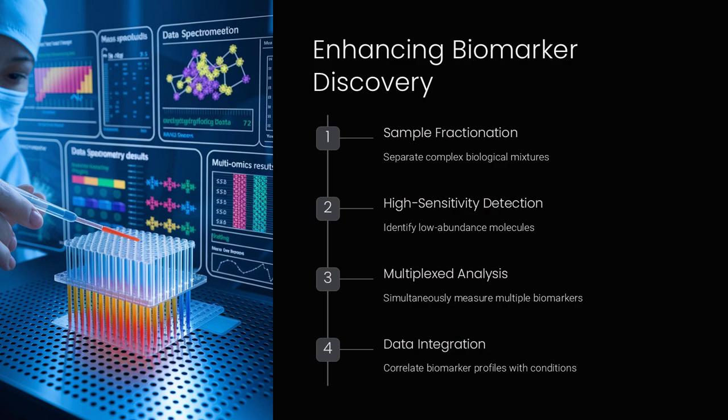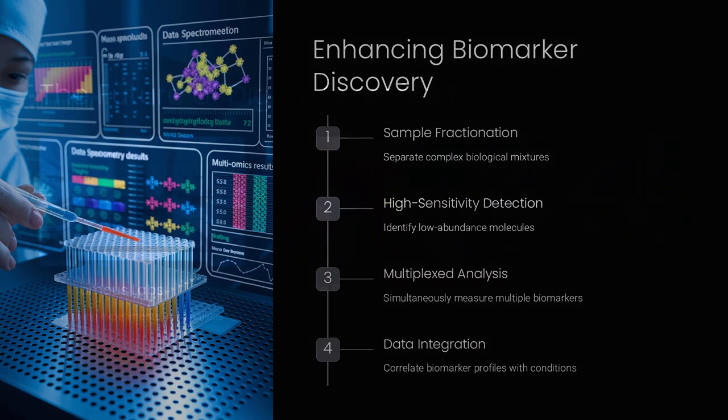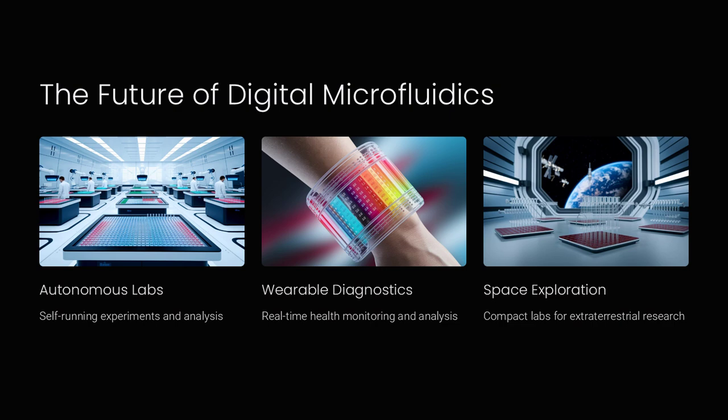Digital microfluidics for lab automation represents a significant leap forward in how we approach laboratory workflows. Its ability to automate complex procedures in a miniaturized, reconfigurable format not only accelerates scientific discovery, but also enhances the reproducibility and accuracy of experiments. As researchers continue to refine these platforms, we can look forward to a future where lab automation becomes more accessible, efficient, and adaptable, ultimately transforming research, diagnostics, and the development of new therapeutics.